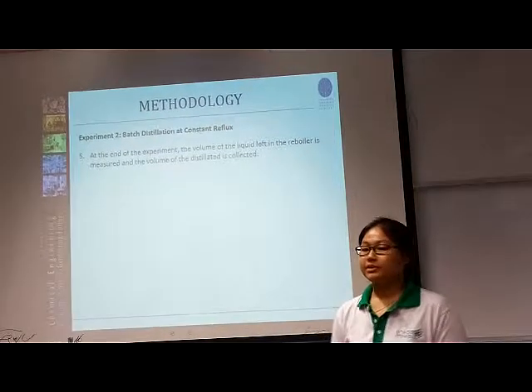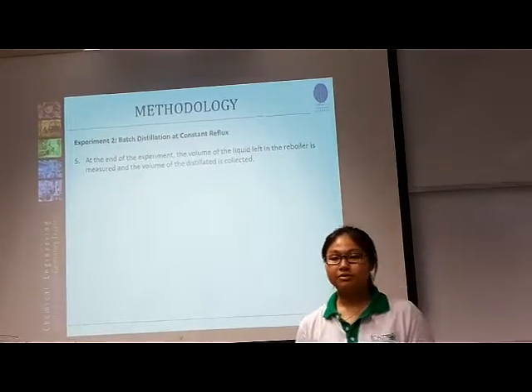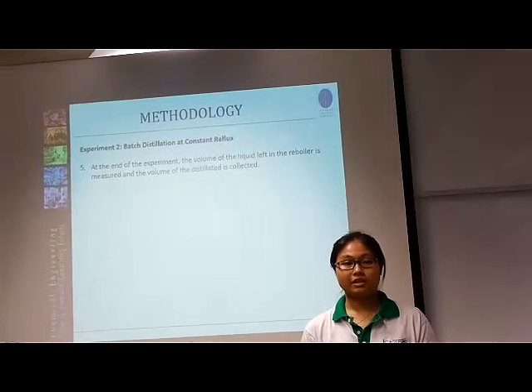Next, the fifth and last one: at the end of the experiment, it is reminded that the volume of liquid left in the reboiler is measured and the volume of the distillate is collected.